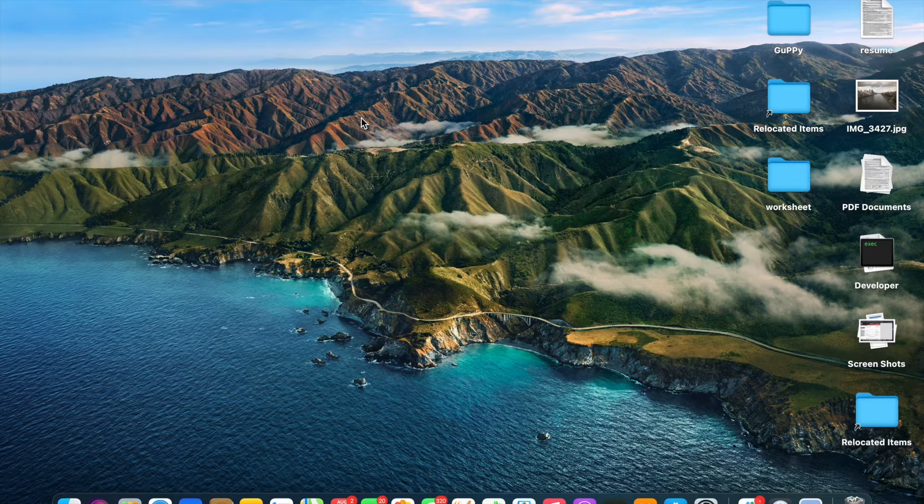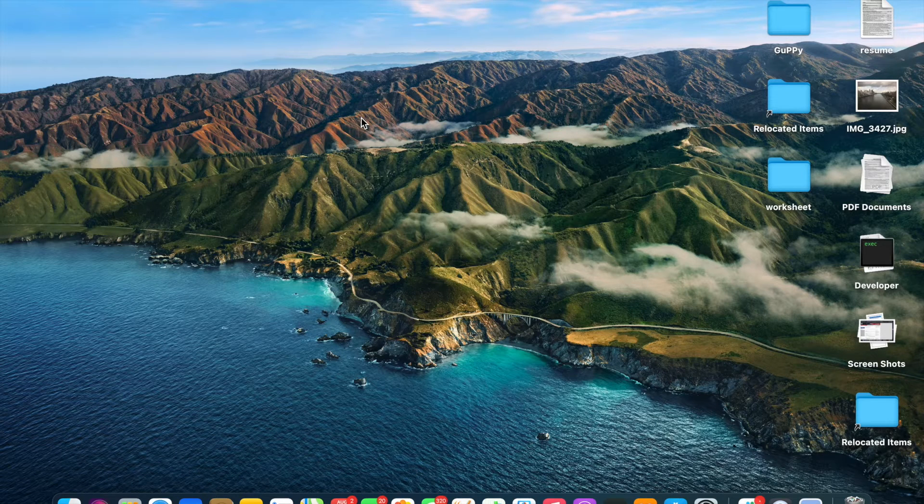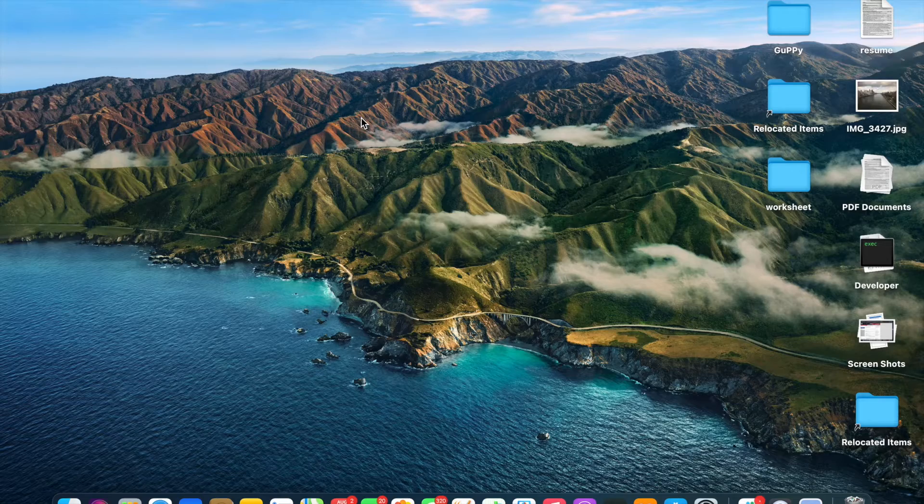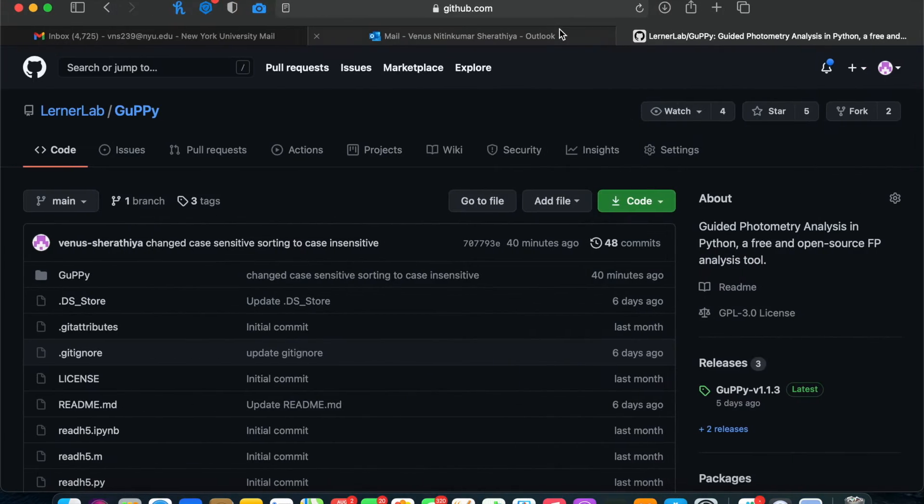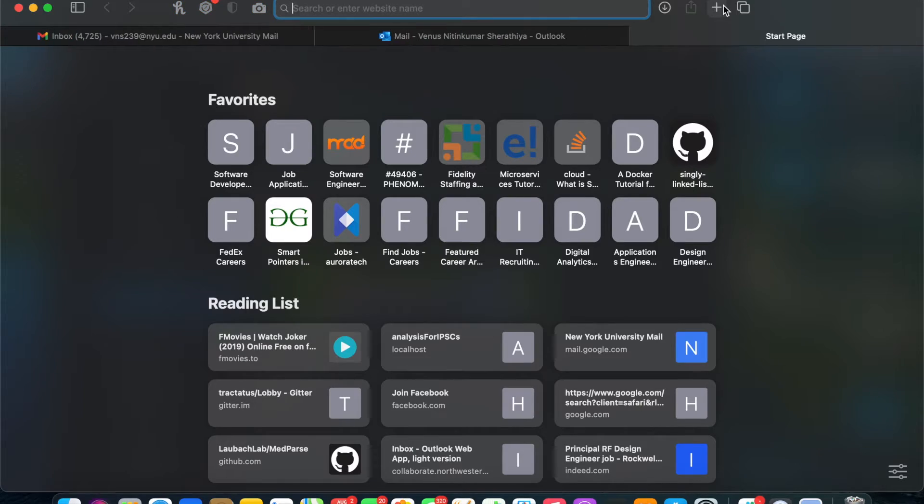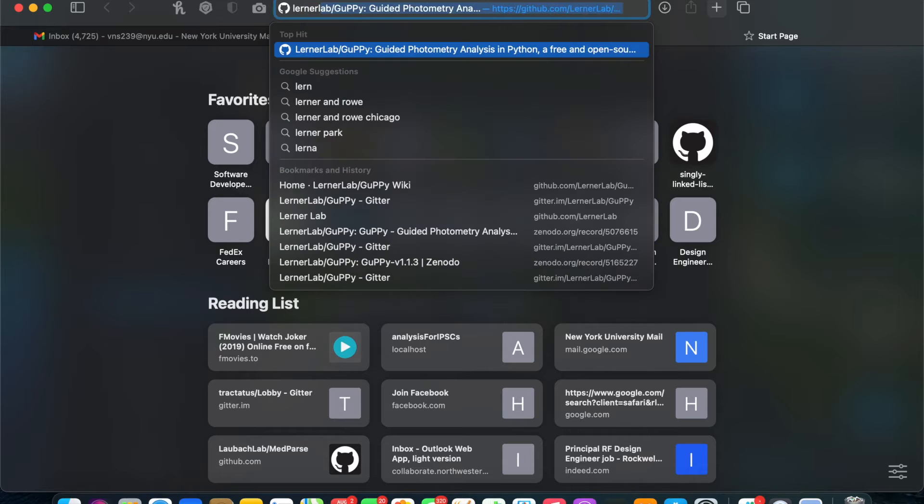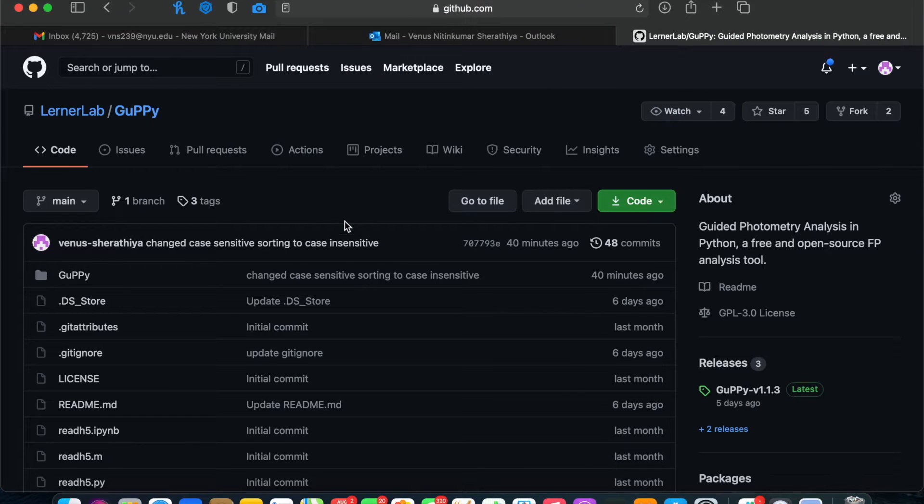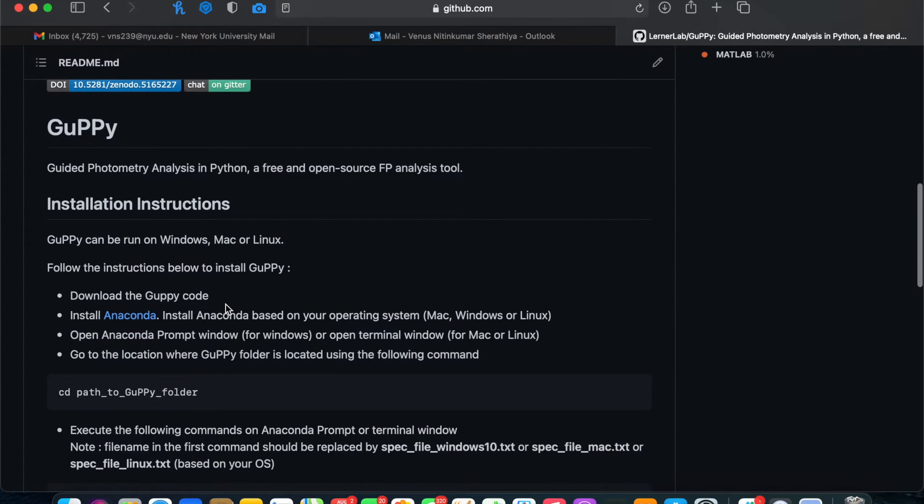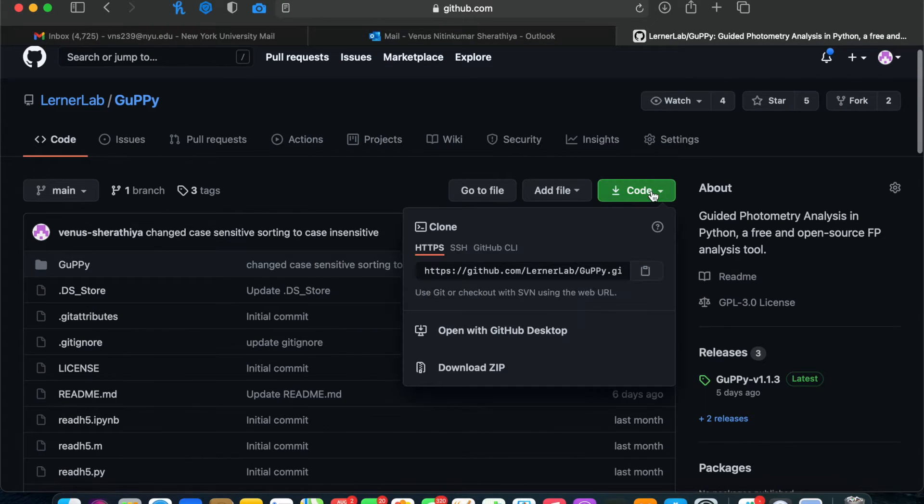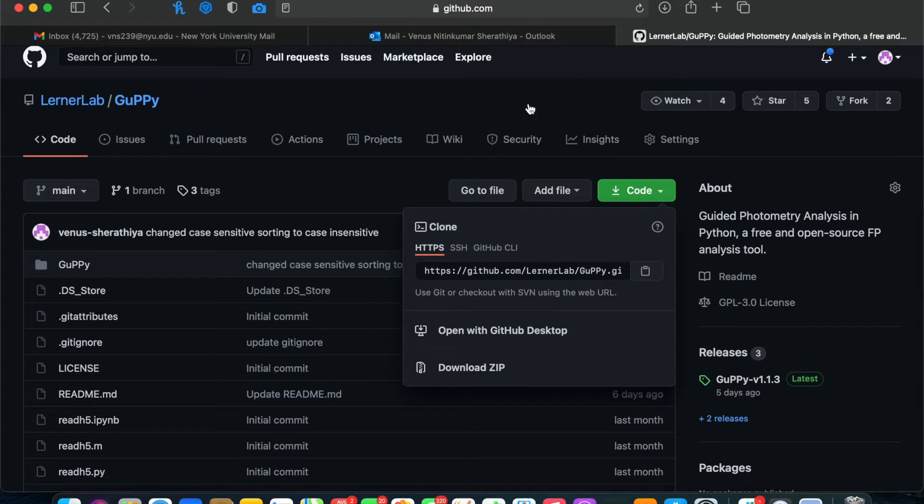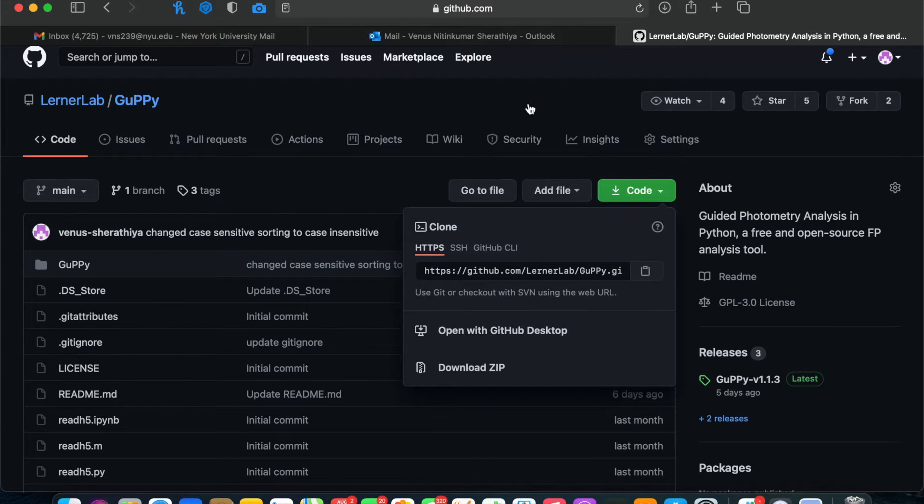So first, what you'll need to do is go to the GitHub page for the Learner Lab and find the Guppy folder. Here, you can see the instructions at the bottom, but you'll need to download the whole file containing the Guppy code. If you're using a Mac, be sure to not place this file anywhere that is connected to the iCloud, but a local drive.